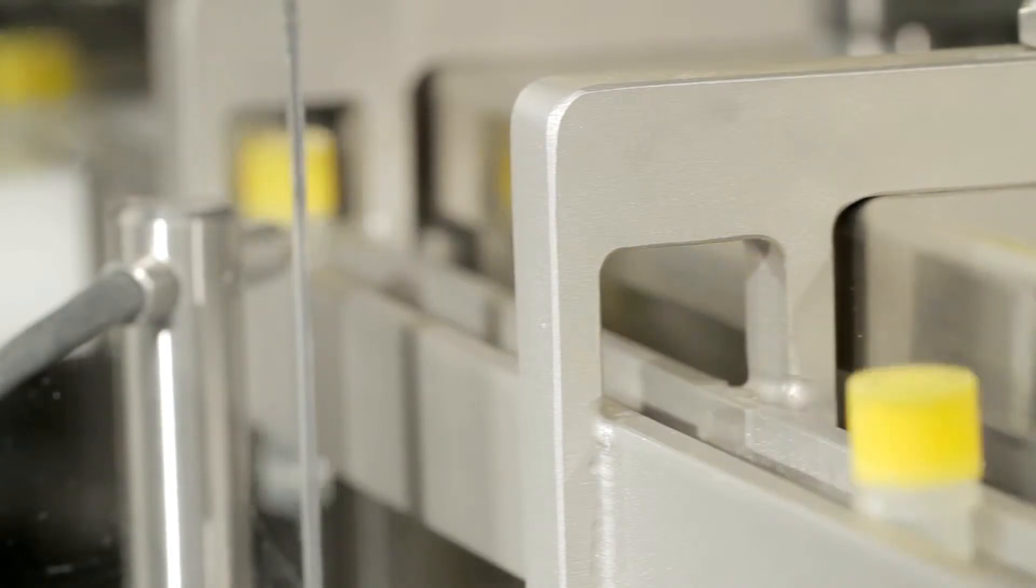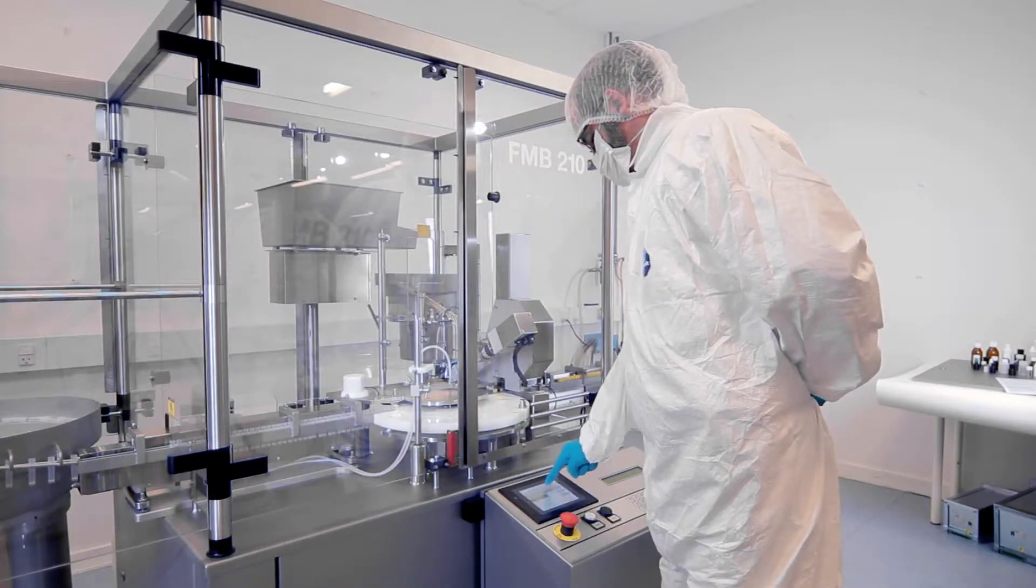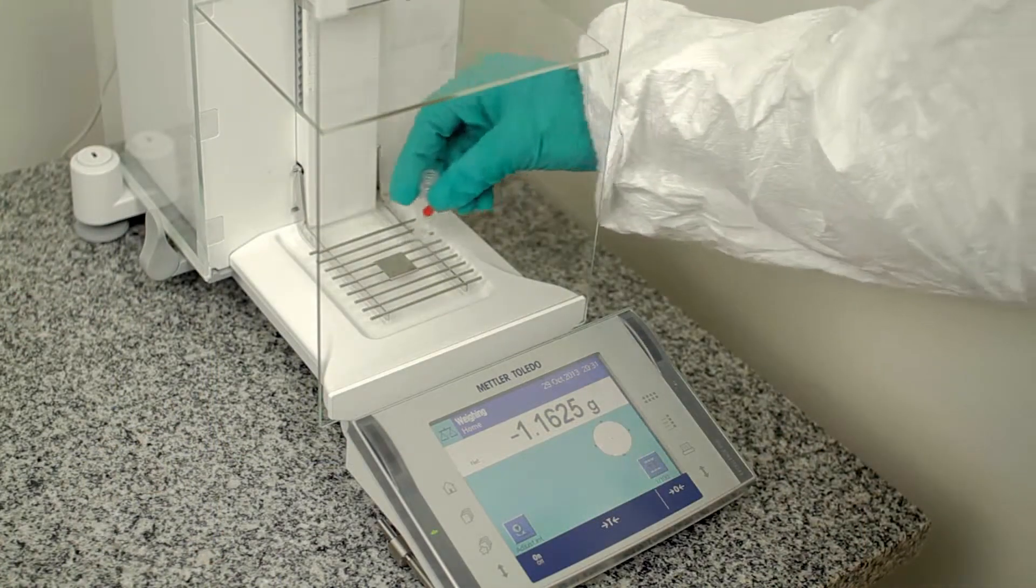An intuitive HMI ensures easy changeover without the need for support from outside the clean room. Calibrating the fill volume is easily done and documented using a standard balance connected to the control panel.